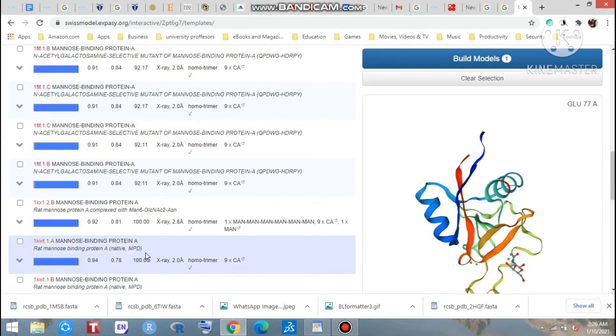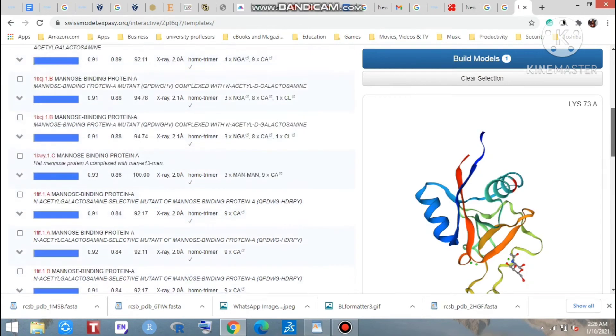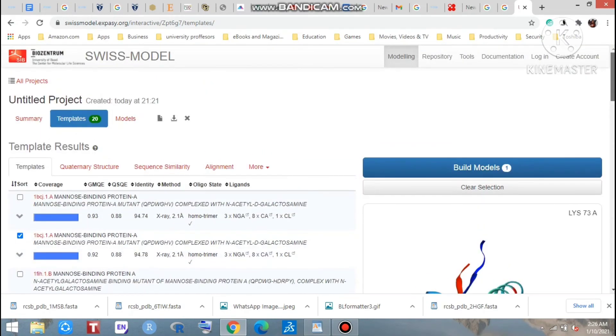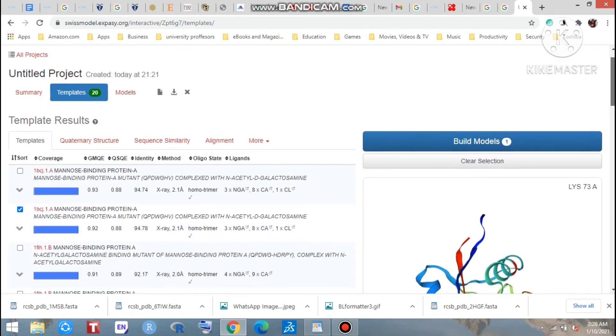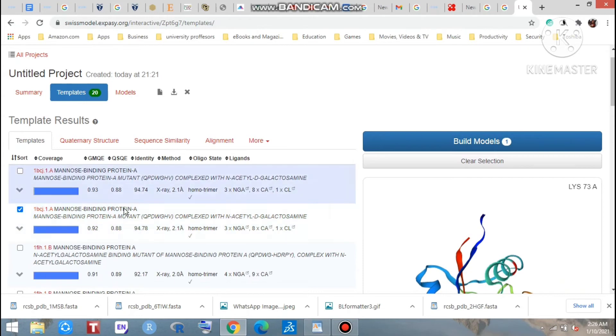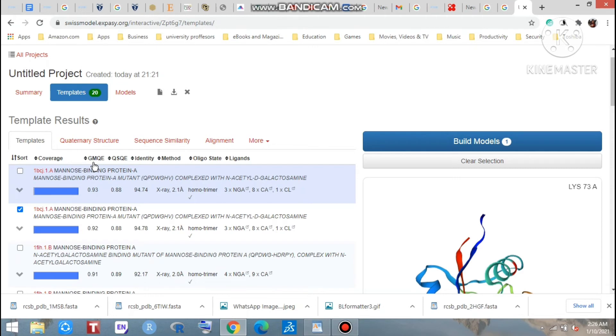But which should we select? To solve this problem, to know about this question, we need to know the GMQE. What is the GMQE? That means Global Model Quality Estimation.